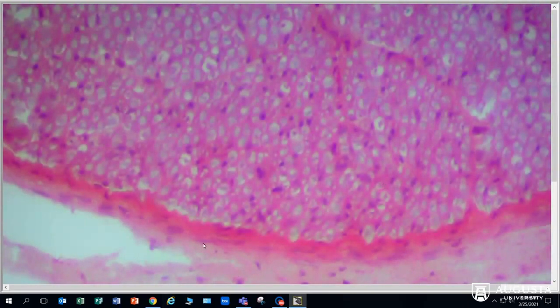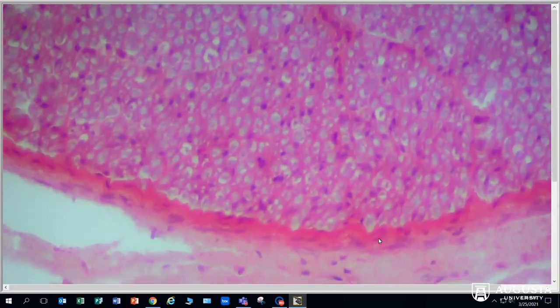So here we have epineurium. Here would be a fascicle, or the edge of the fascicle, with the perineurium. And then each of these dark dots here is an axon. The white space surrounding that axon is the myelin sheath, which in the peripheral nervous system is formed by Schwann cells. We will ask you to identify the endoneurium on the model for the neuron.